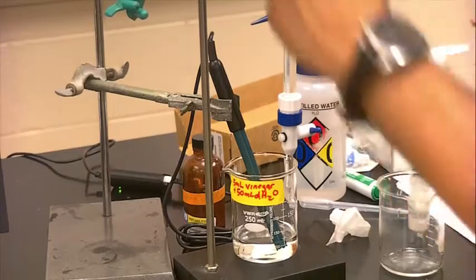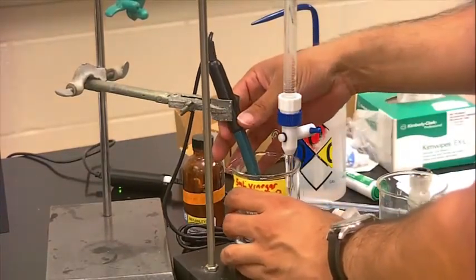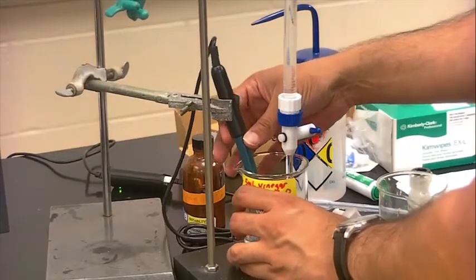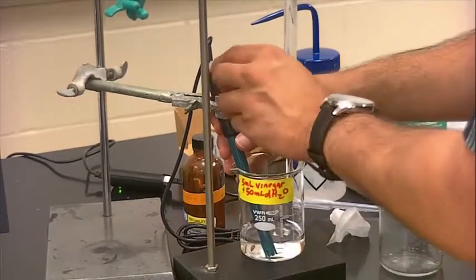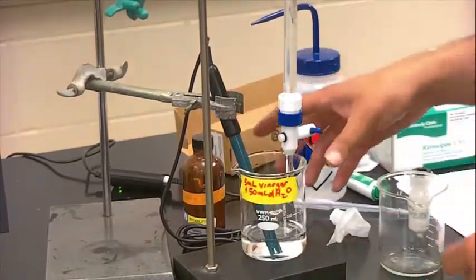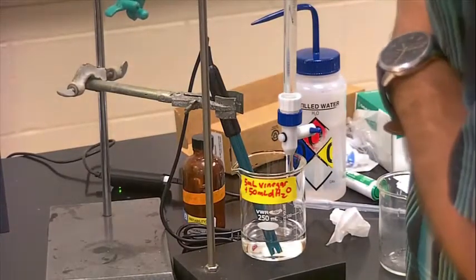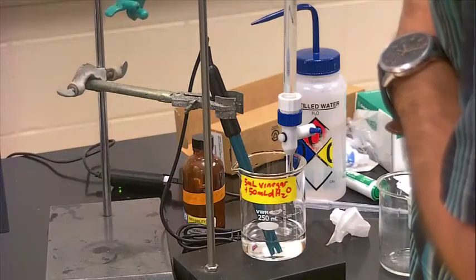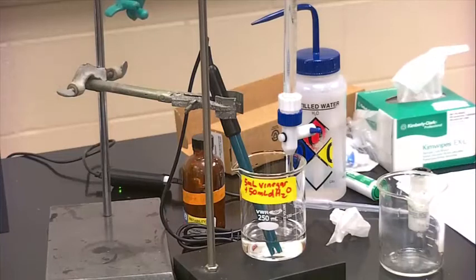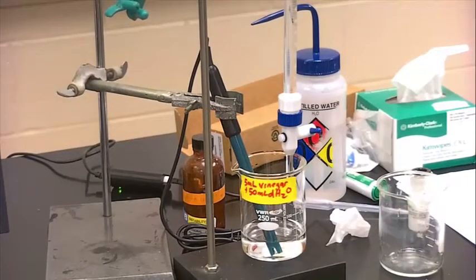And it's there. So you're probably going to want to get your partner to stir this around. Okay, so make sure you have some good stirring here. And then my electrode came loose, so you want to make sure you can stir and that the titrant gets in there. So how much did I actually add? I added about 1.19 mils, okay? So I'm going to add that 1.19 mils here.